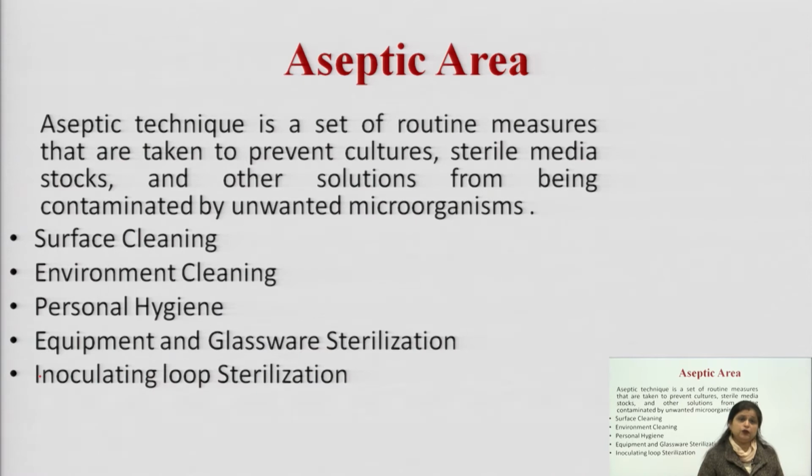We have to clean our surfaces on a day to day basis. Whenever we go to the laboratories, we have to put on lab coats and follow all the hygienic conditions. We have to wash our hands, cover our hair and use the mask. We have to take care of each and everything, from surface cleaning to environment cleaning.